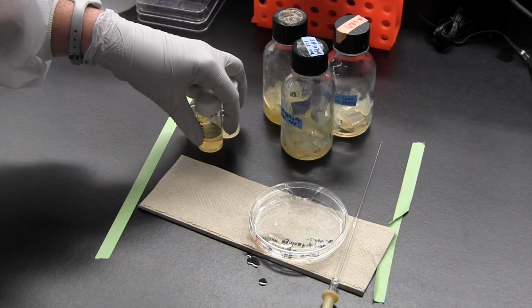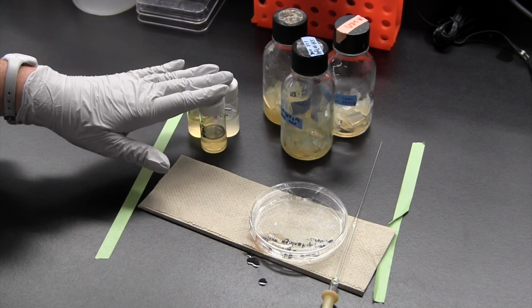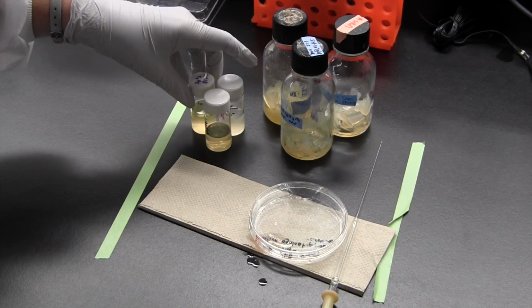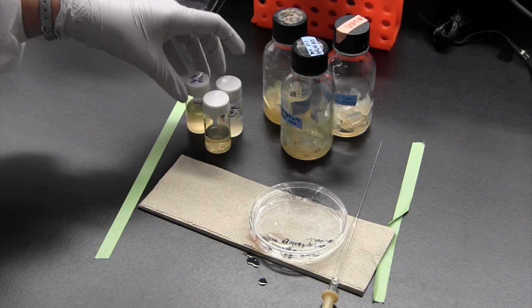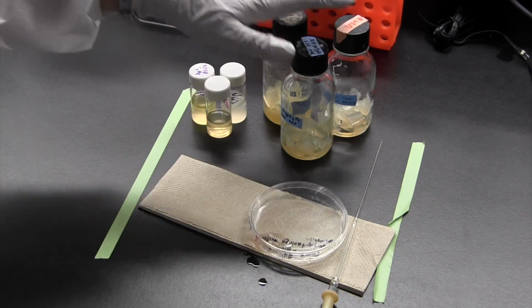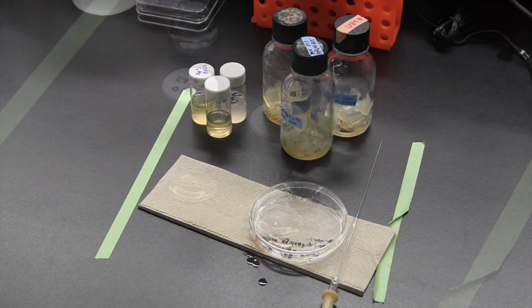Some places might feel the need to reuse your scintillation vials. So here you would have to go through probably a pretty stringent wash cycle to just make sure that you're safely reusing them. But most people actually dispose of the scint vials because they are disposable and fairly affordable for that purpose. So hopefully that helps answer any questions in terms of what to do with your waste at the end of the chemical extraction.